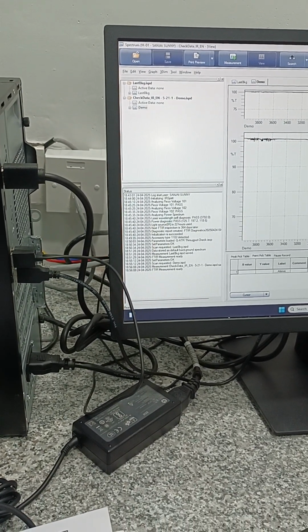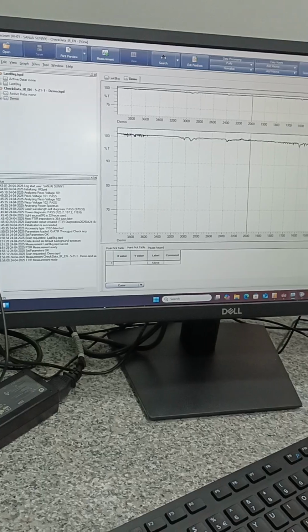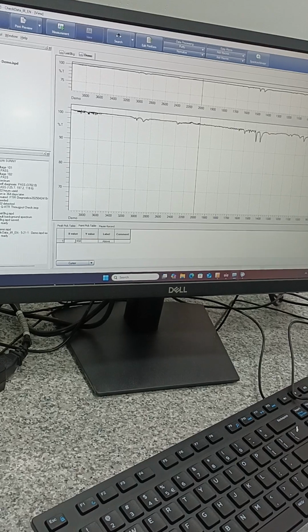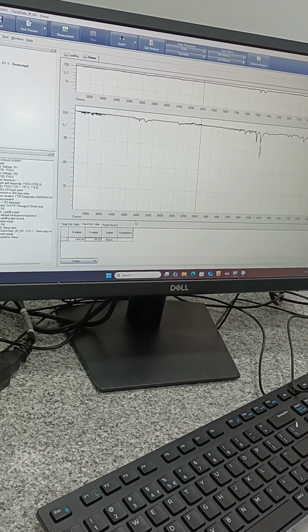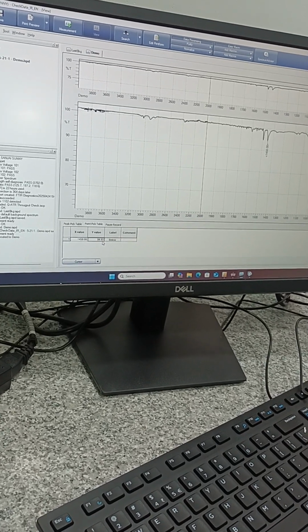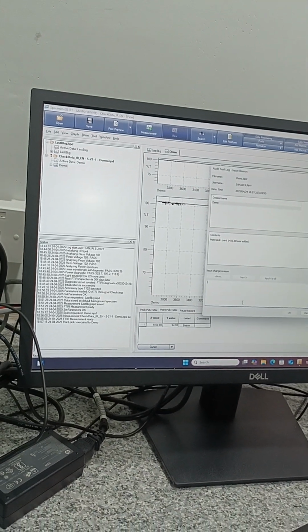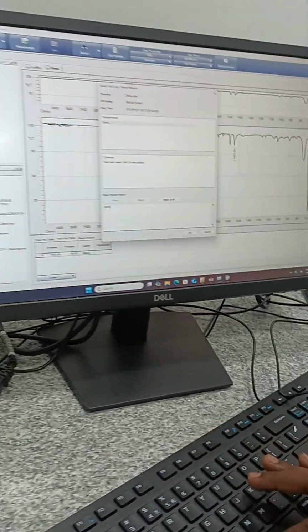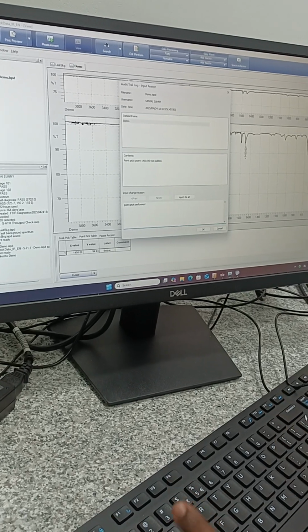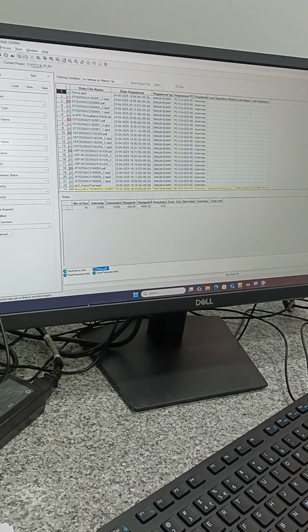I am going to pick the peak at 1450, for example. Just enter 1450 on the x-axis, then enter. It shows 94.93% transmitted. The save button is highlighted again, so you click save. The processing you have done is point pick, performed. Now the version will be version 1.